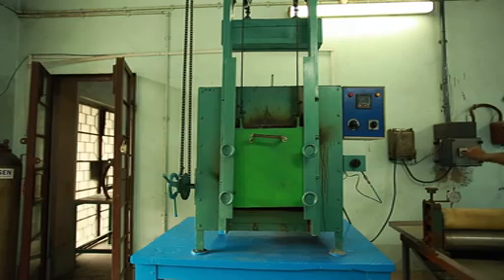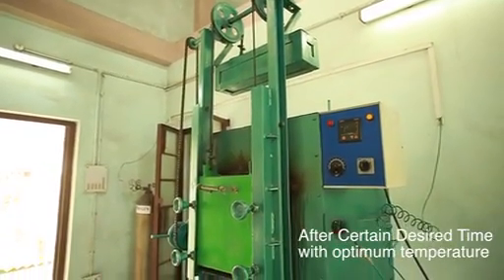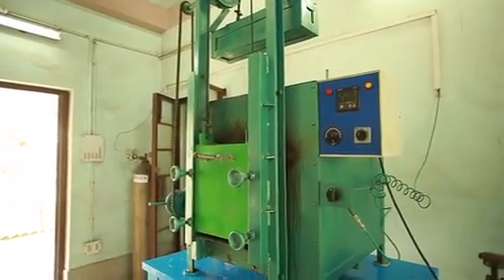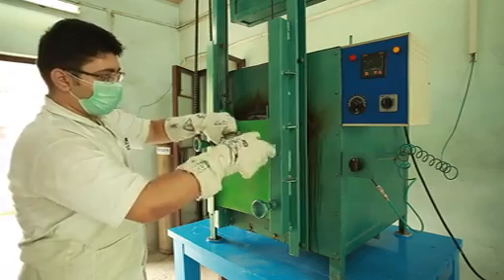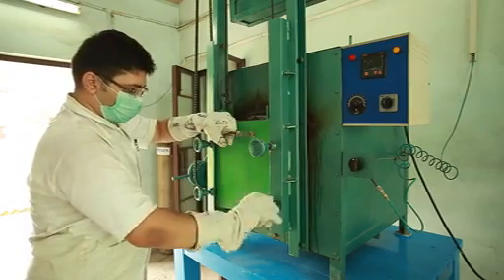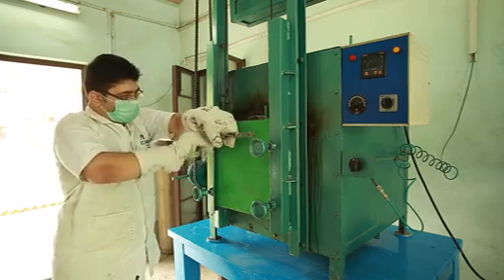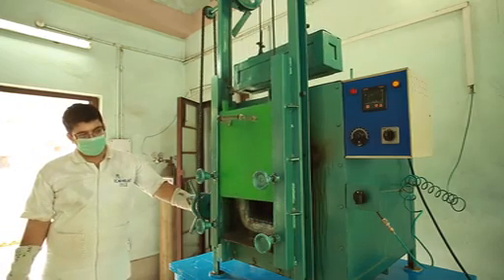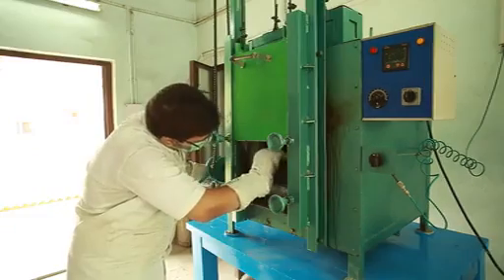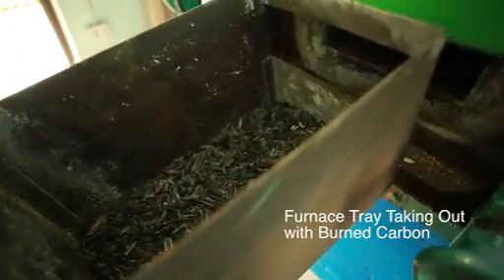The furnace temperature and other setups are set to our requirements, as you can see. After a certain desired time and after reaching a certain desired temperature, we hold the whole reaction, and after that we let the temperature cool down and we collect the activated carbon. As you can see, the jute sticks that we had already kept in the furnace have already turned into activated carbon.